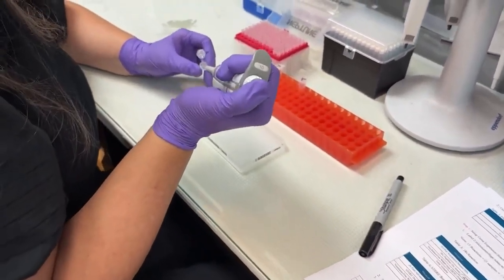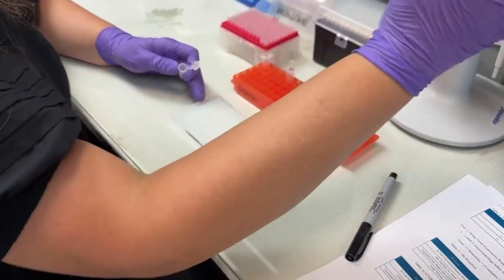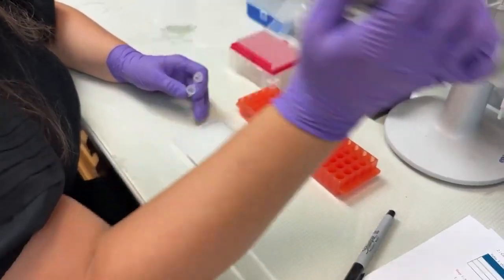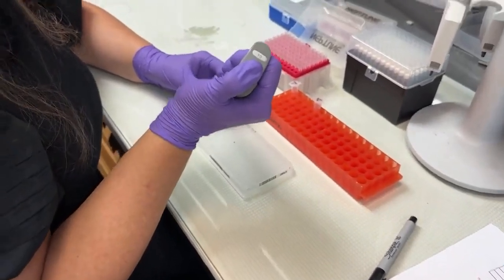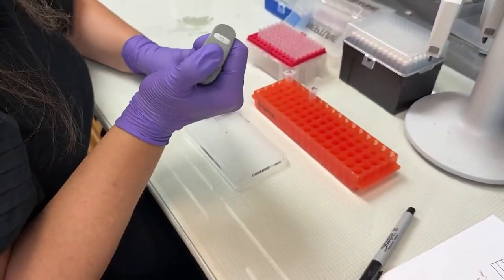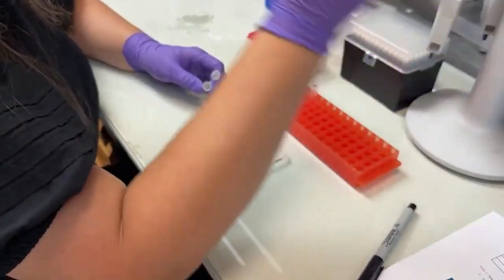Now in row C, I'm going to add sample 2. Changing tips between each one to make sure I'm adding the appropriate volume. I'm also using my finger to track where I'm at.